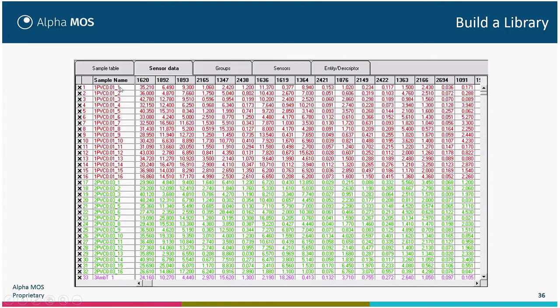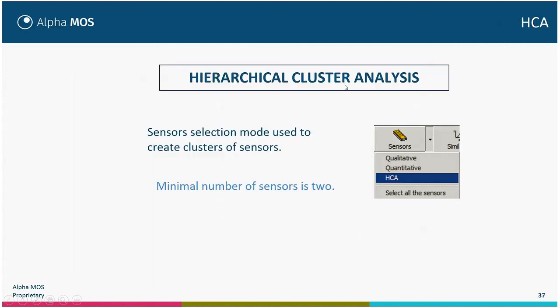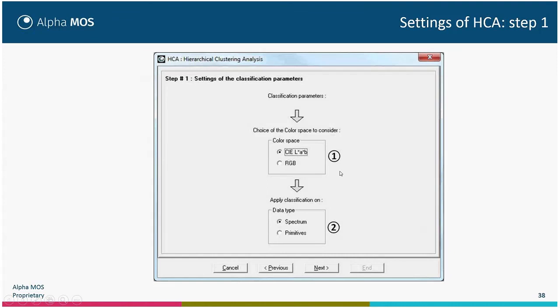Each object will appear in a single line and the proportion of each color will appear in each column. You can do hierarchical cluster analysis (HCA). Select HCA — the minimum number of sensors is two — and first select the dimension: LAB or RGB. LAB is closer to human perception; two colors that are close in human perception will be close in LAB, which is not always the case for RGB. Both can be interesting, but first LAB should be used.